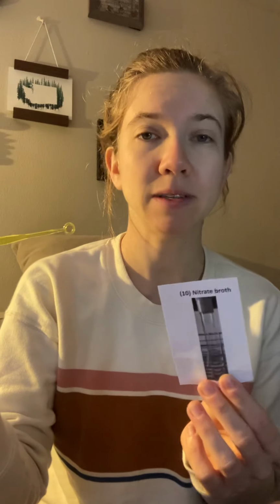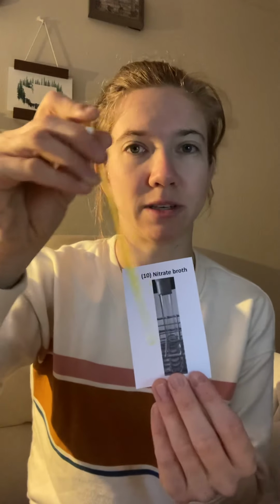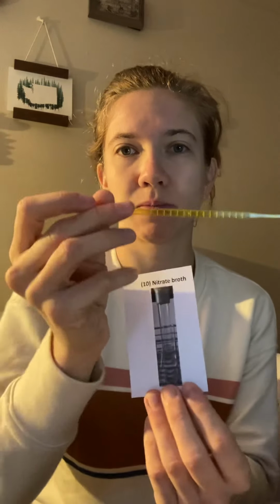Next, you're going to take your samples. In this case, we're just doing the one. Remember, we have 5 in an in-person lab. Again, open it with that pinky finger, hold it in front of the micro incinerator 2 to 3 seconds to kill off any bacteria, and then you can inoculate your sample with this particular source culture. Hold that in front of the micro incinerator, lid back on, hold this inside the micro incinerator, take it out, and you have inoculated your broth samples.